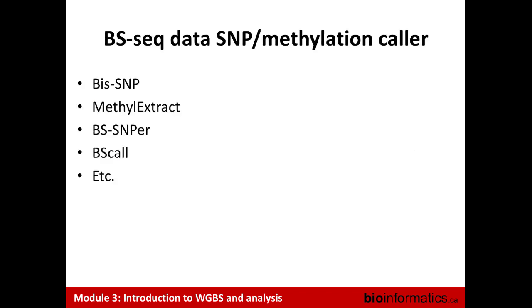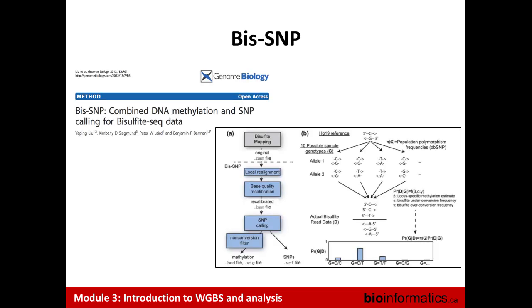But as I said, there are some tools out there that do that. So BisSNP, for instance, that we won't be running in this case. If you're interested in this, I encourage you to look at some of these papers. BisSNP is one tool that we typically run at the end of Bismark to call SNPs from this data as well.